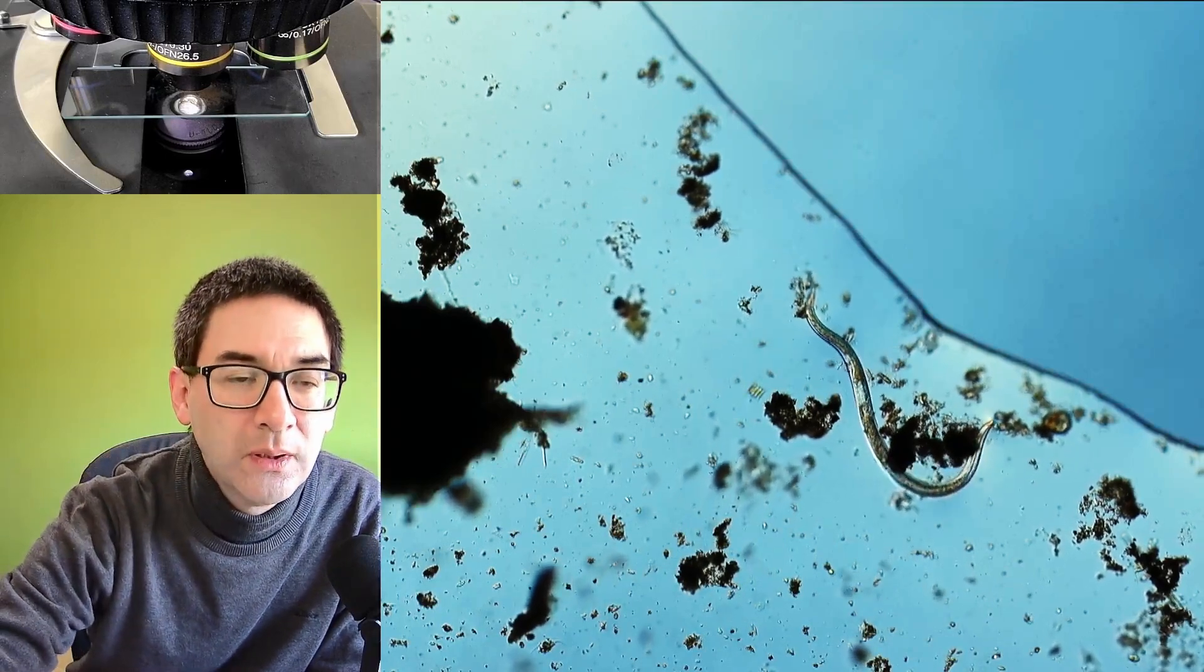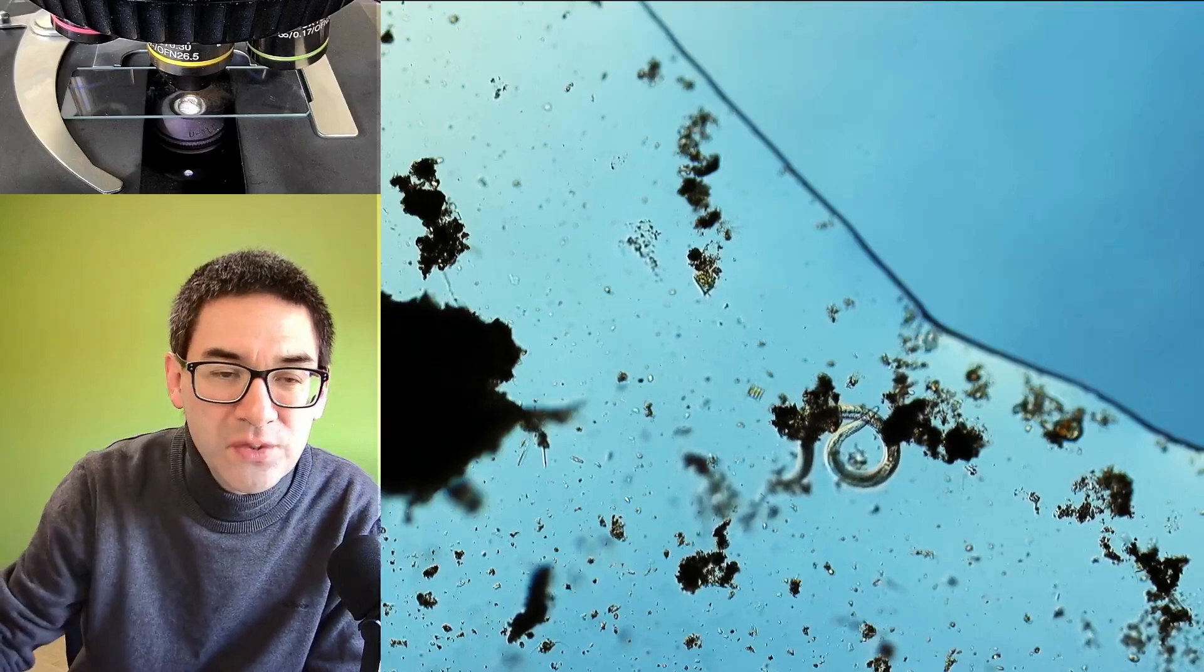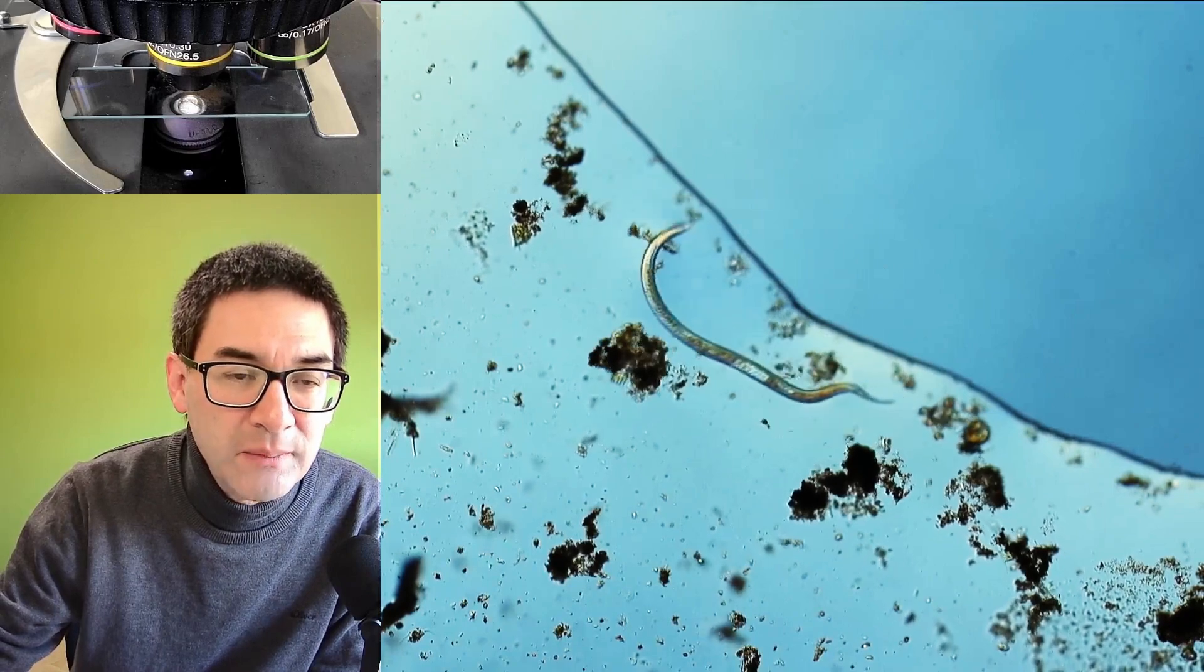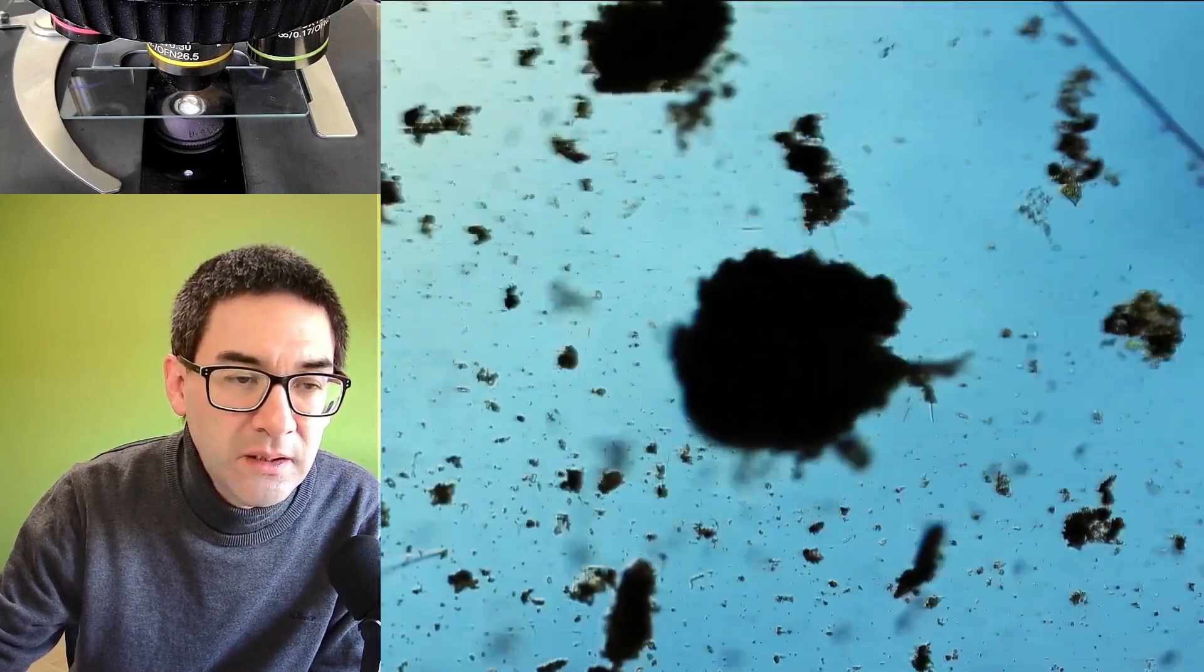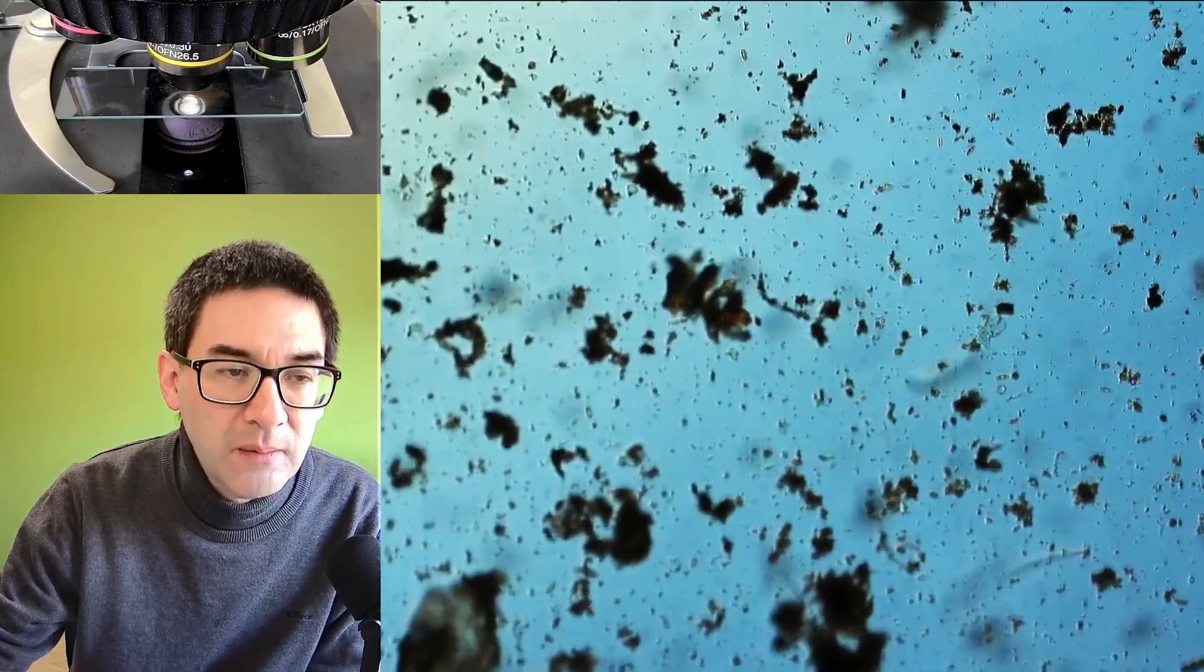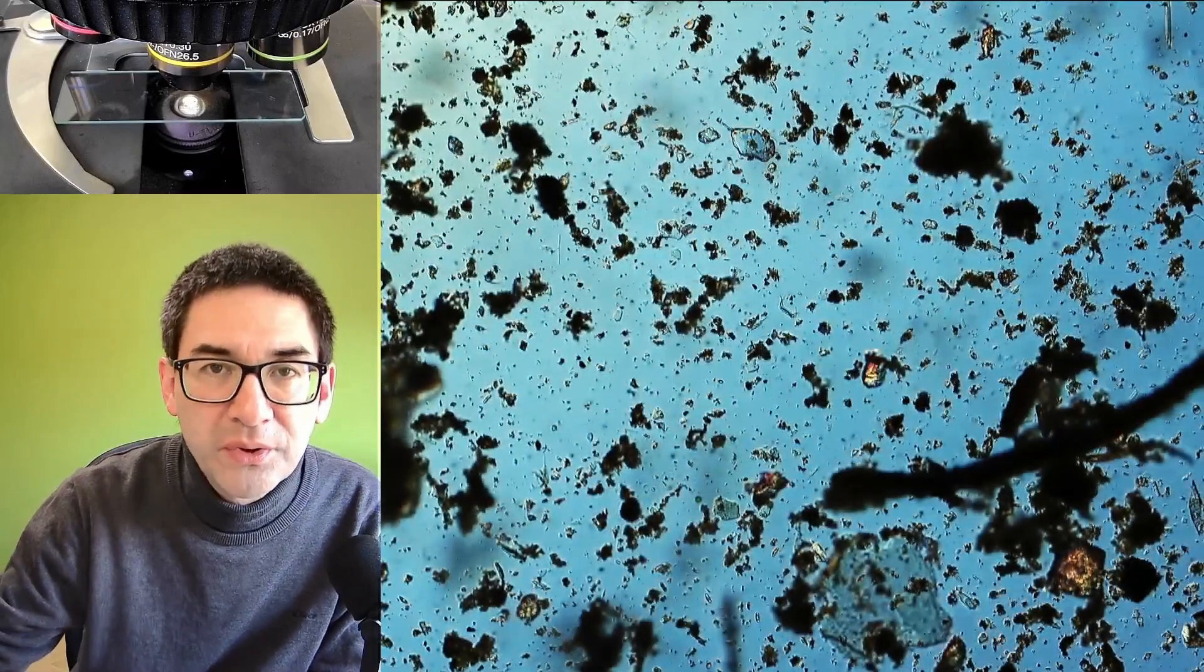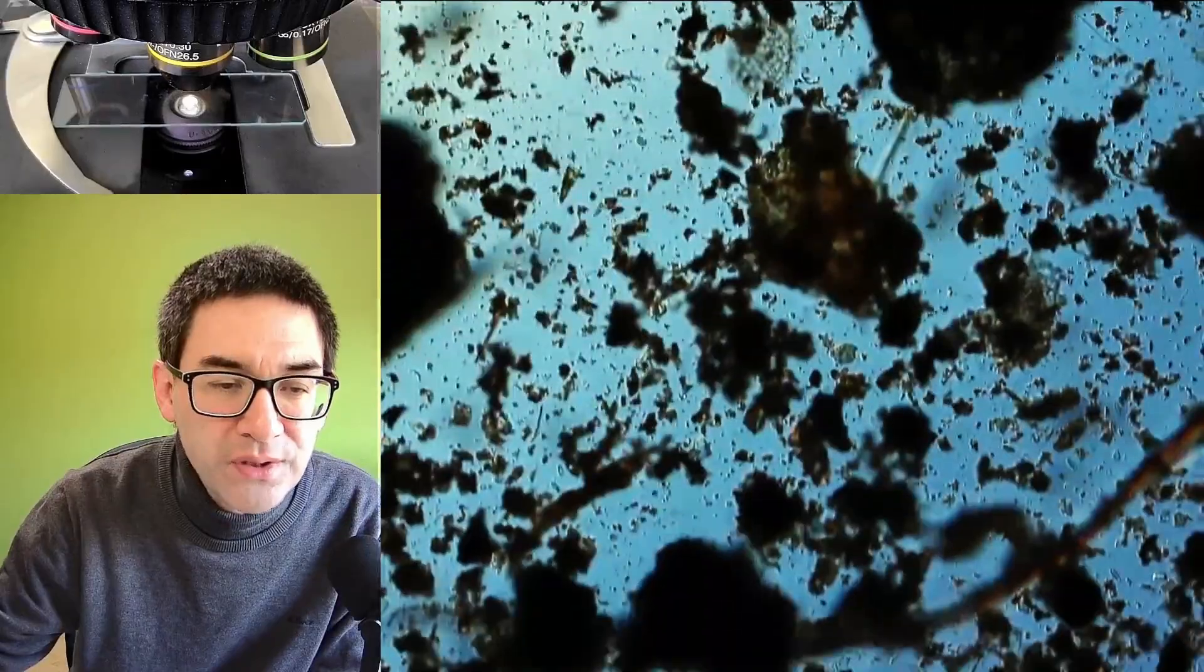So this is the moss sample one day later. Well so far no tardigrade but at least I found a few nematode worms and this one is actually fairly large, evidently decomposing the organic material. And I found a rotifer and a ciliate so there are also other living things creatures in there but not as many as I hoped to be able to find.